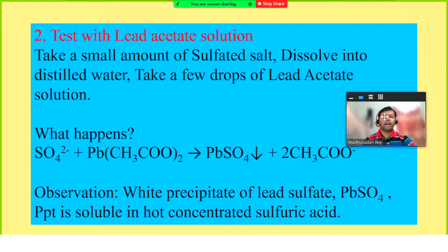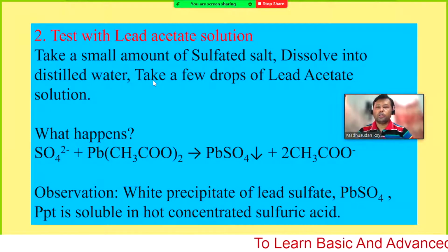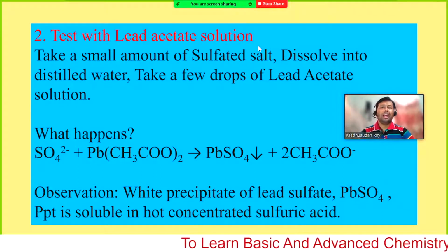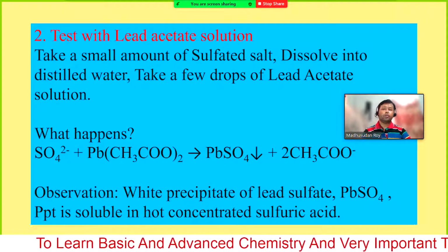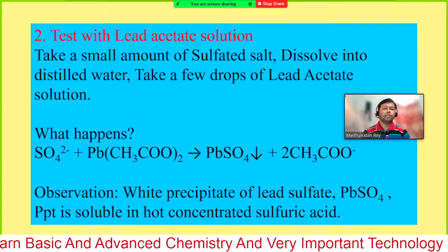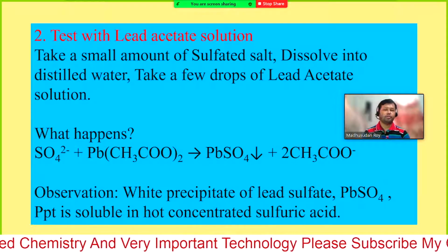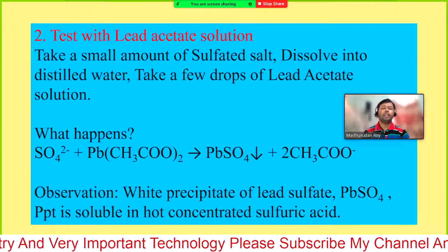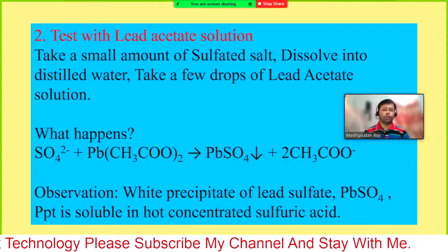Now we have some other tests to confirm sulfate, but I will not show you the video. Test with lead acetate solution. We can have several tests. The test with lead acetate solution is also similar, just a different chemical. Previously we added barium chloride, now we will add lead acetate solution.